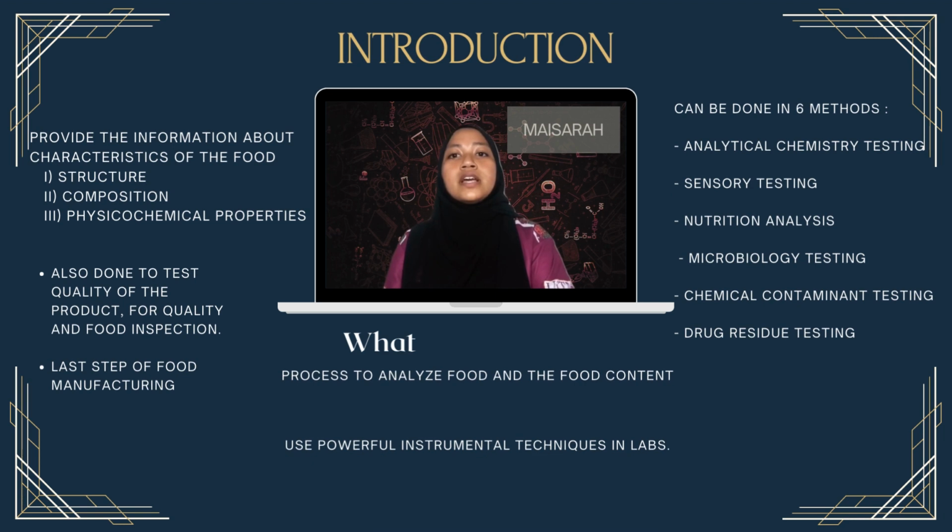What is food testing? Food testing is a process to analyze a food and the content of the food. Food testing will provide information about characteristics of the food, such as structure, composition, and the physical-chemical properties. Other than that, it is also done to test the quality of the product for quality control and food inspection.